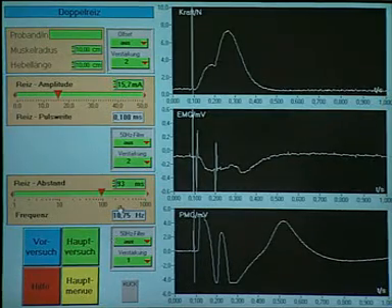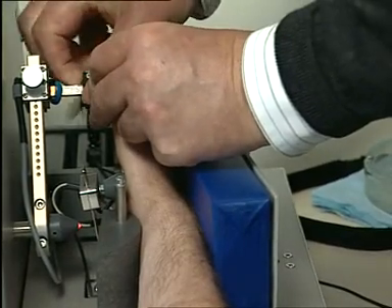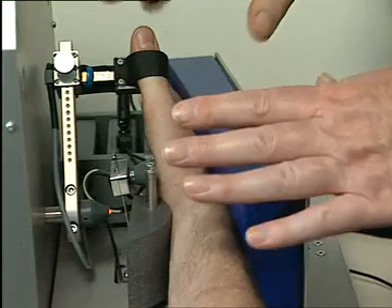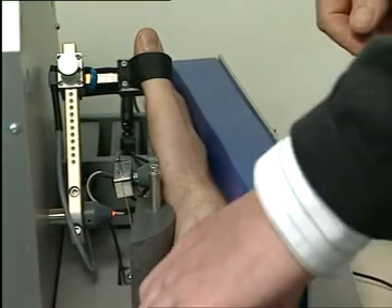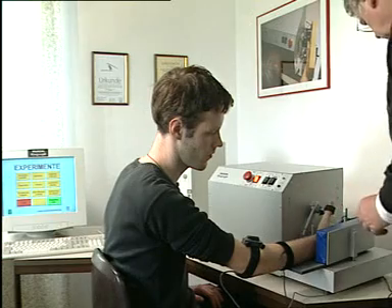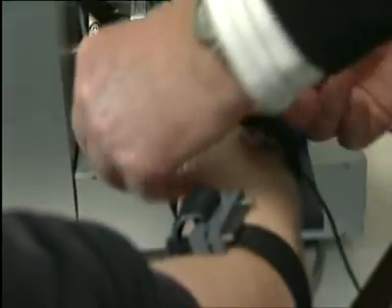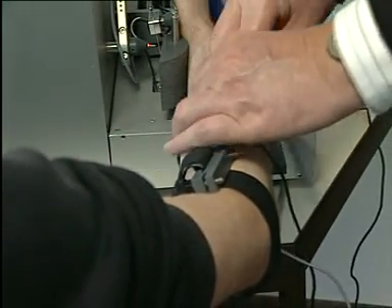The myograph describes the interaction between the nerve and muscles and documents the results of this test as an answer to a specified stimulus. The test person must fit their right hand and find the correct position for the EMG connections, the right position for the power sensor, and so on. The next part is to find the right position for the stimuli electrode.